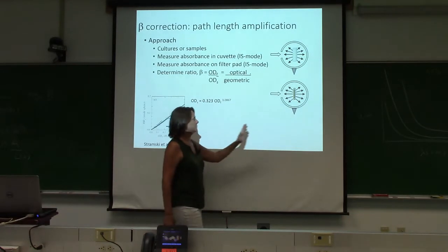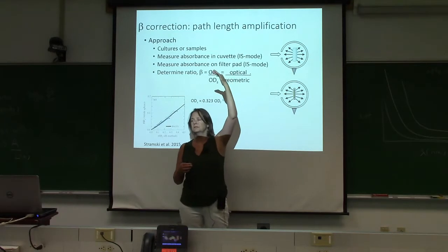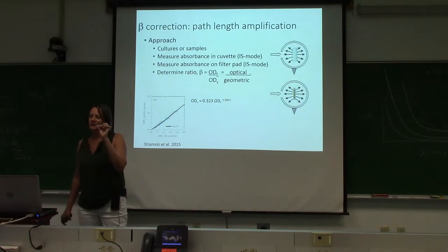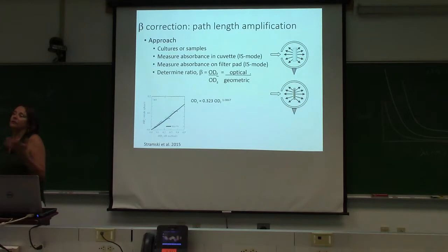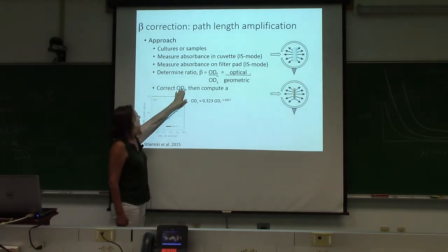If you measure a filter in a transmissometer mode where you're not in an integrating sphere, you get this huge signal because it's scattering so much light out of the detector. But what you can't do is predict how much of that light goes through your sample multiple times and essentially increases the path length of absorption, the optical path length. It corrects for other things. Yeah. It has an instrument noise as well, but it's pretty low. So. Okay.